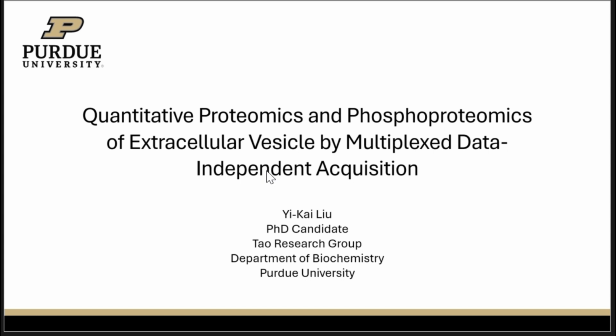So in this presentation, I will introduce our recent study using multiplexed DIA method to study the EV proteomes and the EV phosphoproteomes. I will mainly focus on the proteome results, and I will share some preliminary data on the phosphoproteomes.